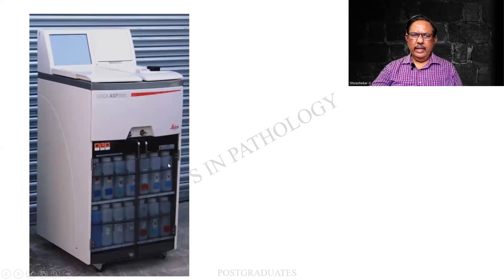This is again one of the latest versions. I find that there is a monitor and again a trough is available. For molten wax, there will be a provision. There are the various reagents. They will come in by a tube to the trough holding the tissues, and there will be another tube draining it back into the same container. These are not small tubes as they appear. They will be elongated almost half or more of the distance of the histokinette. So they are quite huge and voluminous.